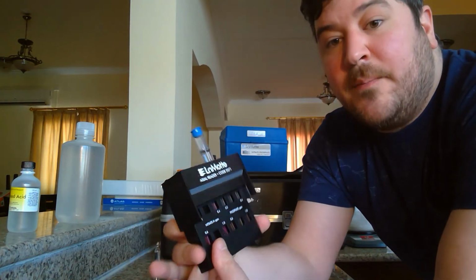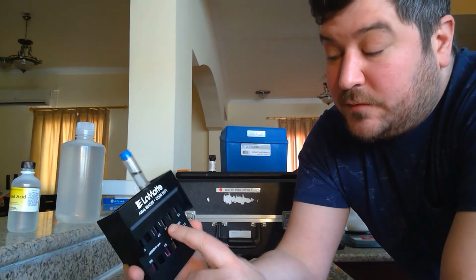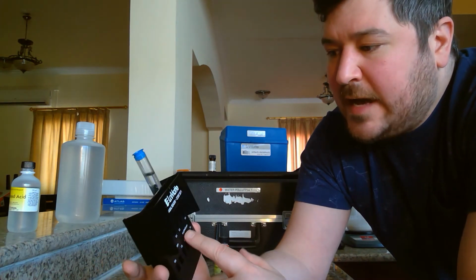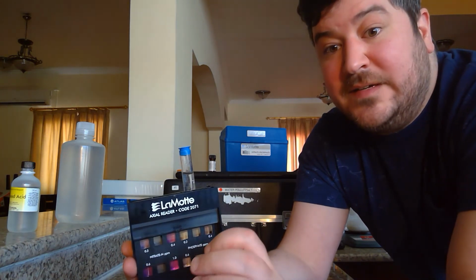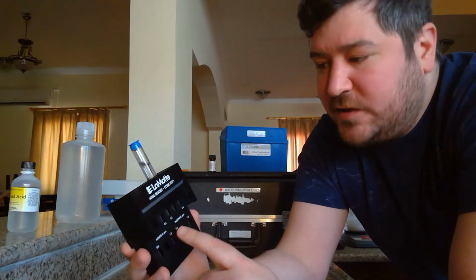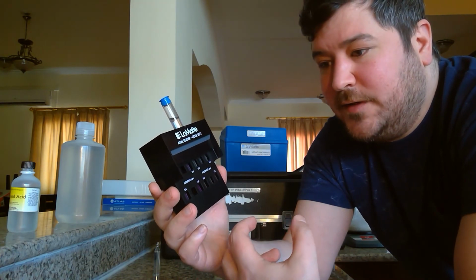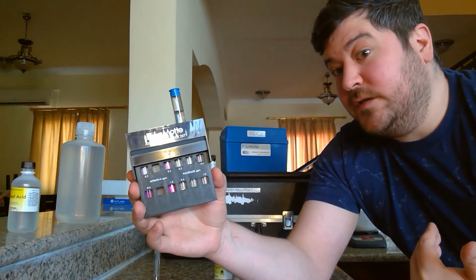The interesting thing about this reader is the 0.2, for me, the way it looks is essentially clear and colorless, similar to the standard water sample and this water sample. Now, I wouldn't be confident saying that this is 0.2 ppm. So here in the nitrate test, it was definitely 0.2. The color matched almost perfectly. Here, it is matching the 0.2, but so does the standard water sample. So for this one, I would be confident giving it a range of phosphate parts per million between 0 and 0.2 or less than 0.2.